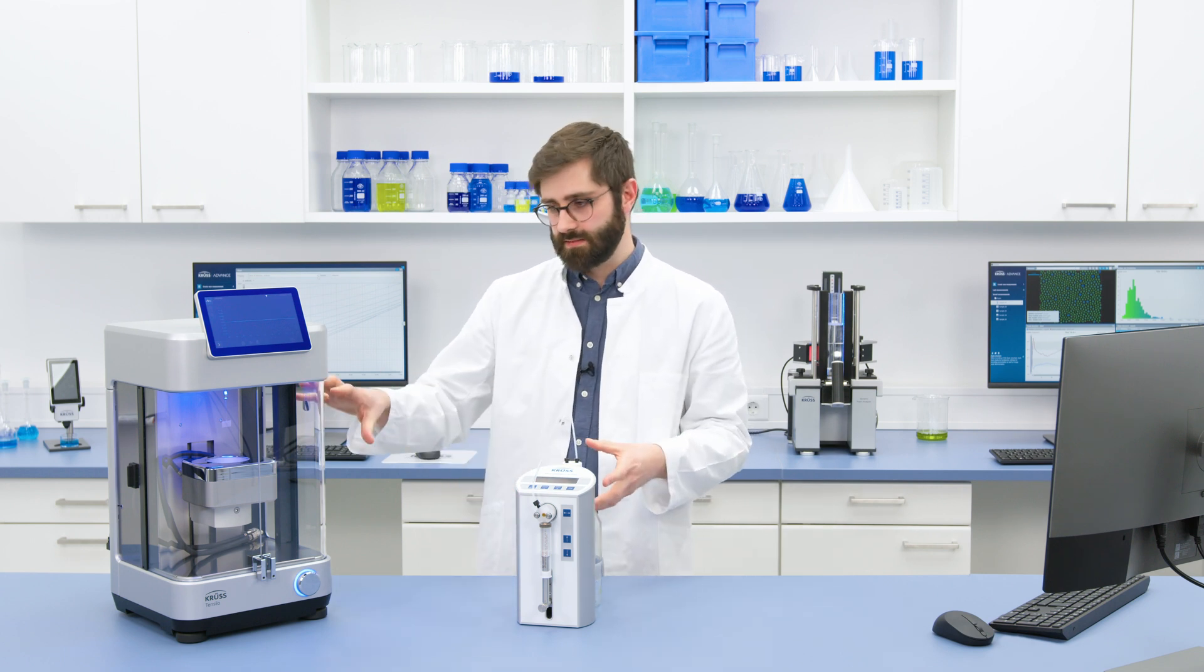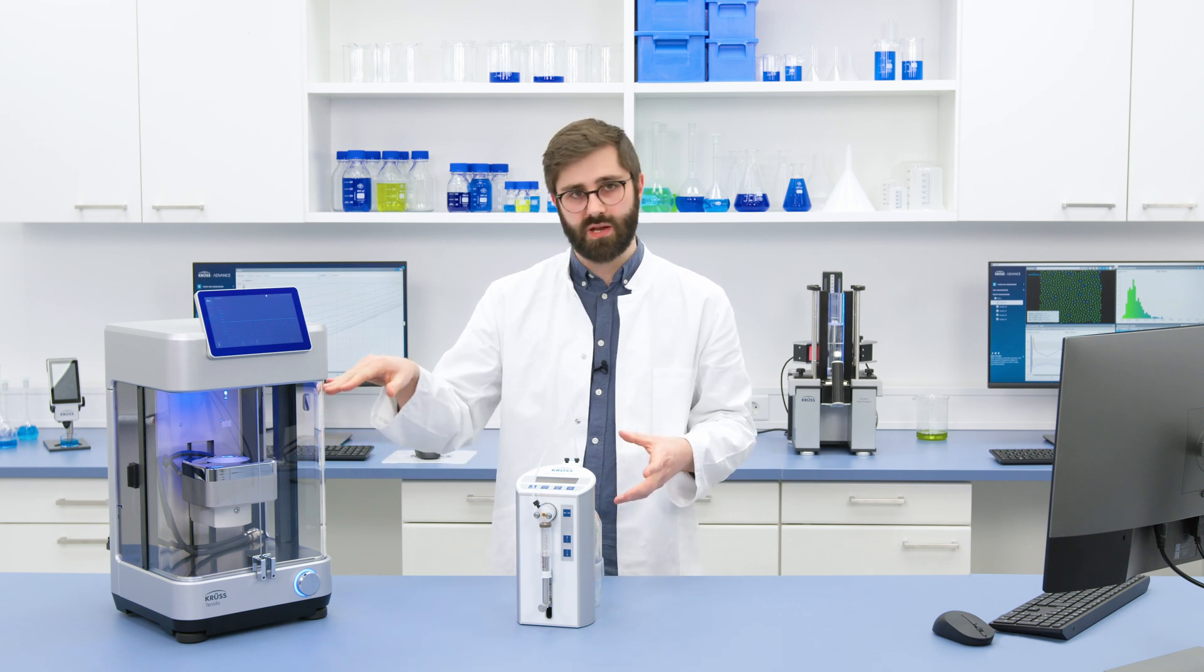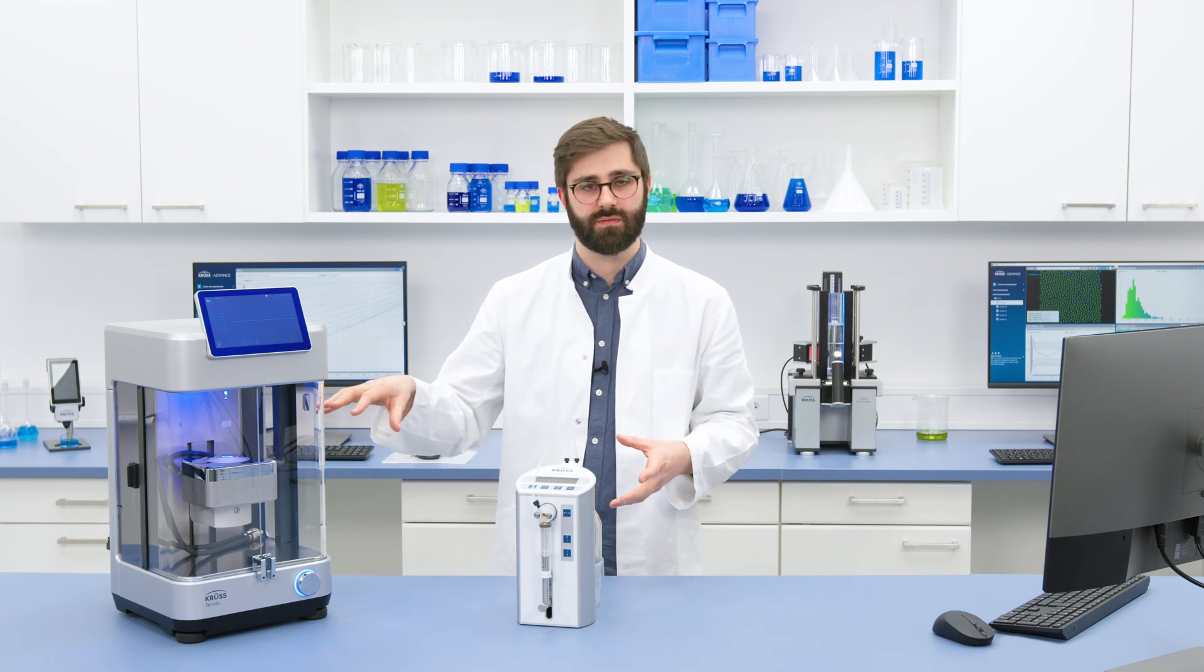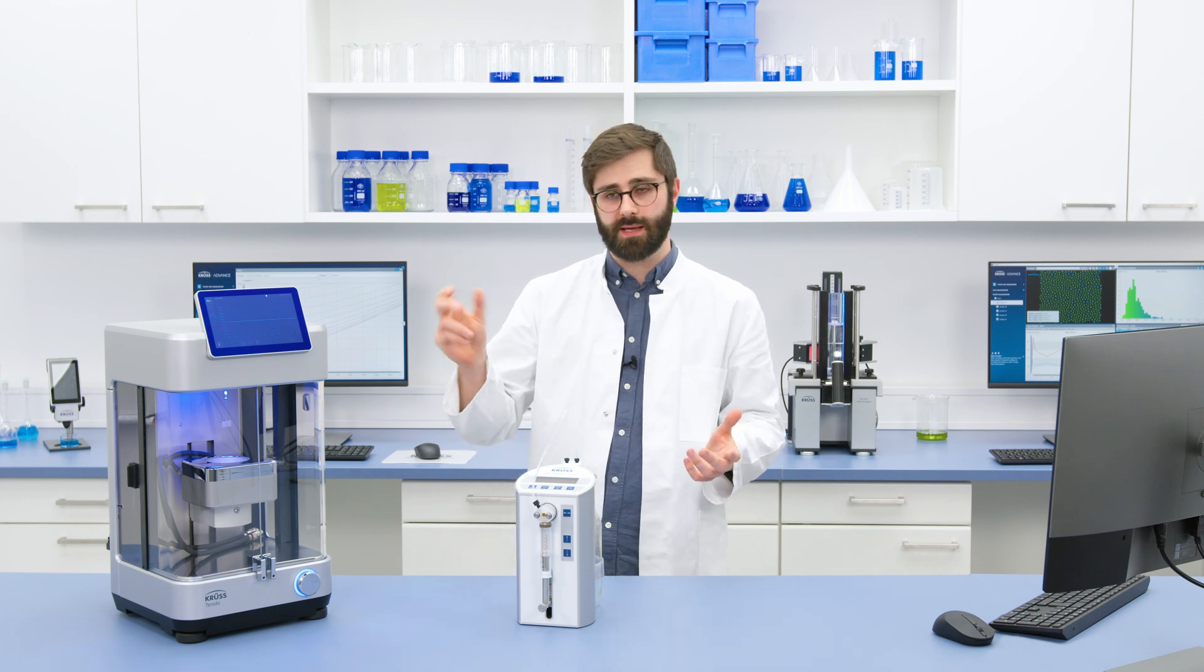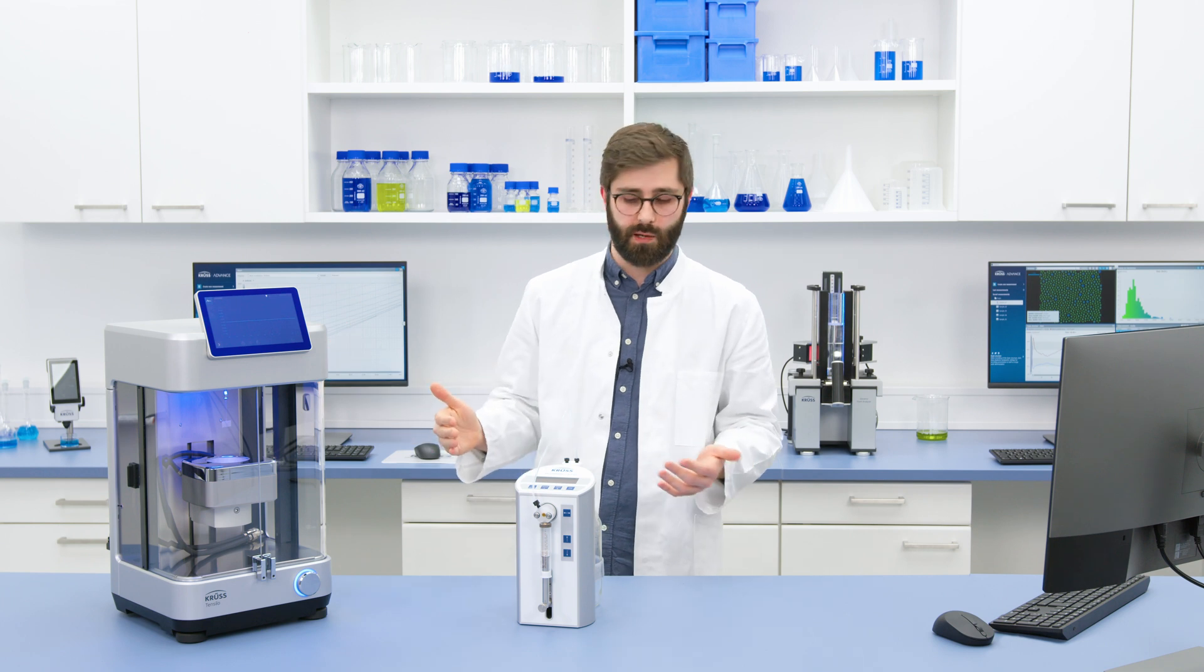So you can use this in connection with Tensio to change the concentration of a sample inside the device. So with a normal CMC measurement you would have to make a new sample for each point of the measurement, and this can take many hours.